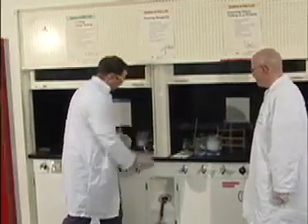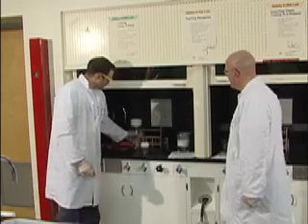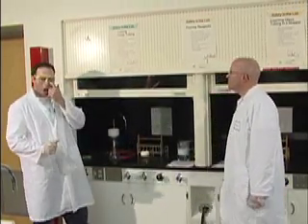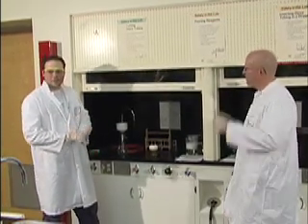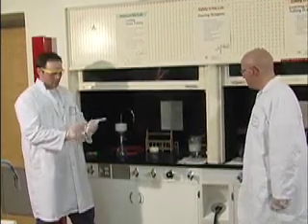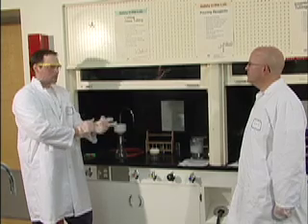Okay, now depending on the numbers in your lab, you'll probably have to do this vacuum filtration on your benches. It does smell a little bit, but it's nowhere near as bad as it is in the beginning. We're going to do it in the fume hood because it's just easier to do it this way.